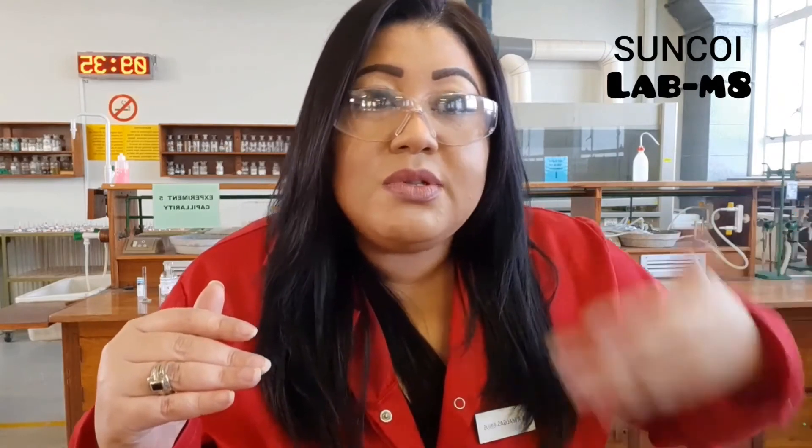Your lab mate will do the experiment for you and he's going to smell it on your behalf, because unfortunately you're not in the lab right now. He's going to tell you this smells like pear or this smells like banana, and you then have to match the chemical name to the fruit or to the smell. I hope you guys enjoy this break, and as soon as we can get back into the lab you can experience it for yourselves again.